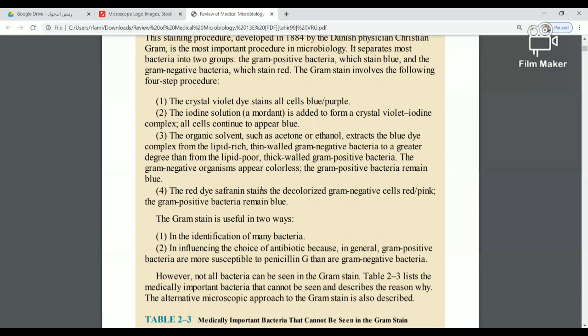Next, I add iodine. Iodine is called a mordant. The mordant fixes the crystal violet dye, so both Gram-positive and Gram-negative bacteria remain blue or purple after this step.